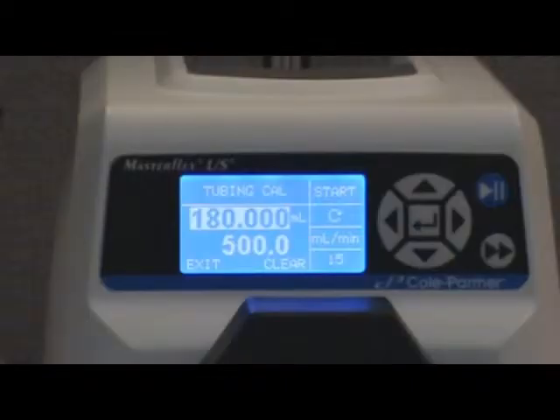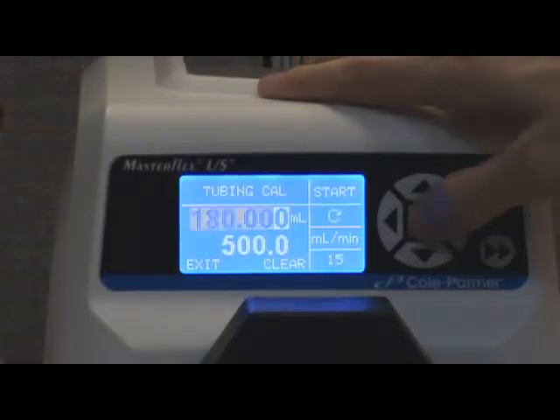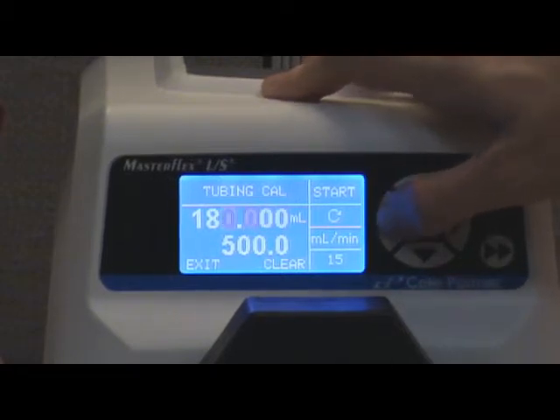After the pump has stopped, read the amount in the graduated cylinder. Be sure to read the bottom of the meniscus in order to obtain accurate results. After reading the volume in the cylinder, the cal volume field will be highlighted. Press the enter button and adjust the volume to match your result.